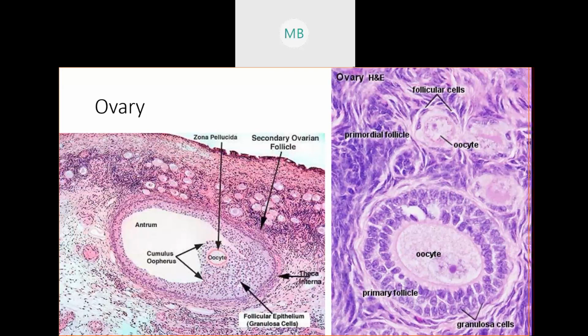The most important thing for you guys to know and understand for this unit with the endocrine system is that ovaries make estrogen and progesterone. And what you're looking for is all this tissue-y stuff, and you can see eggs here. So these are just clustered eggs. And there's usually one egg that has been chosen and is the growing one. It's going to have this large bubble area around it, like a buffer, so you can see this one larger developing egg right here.